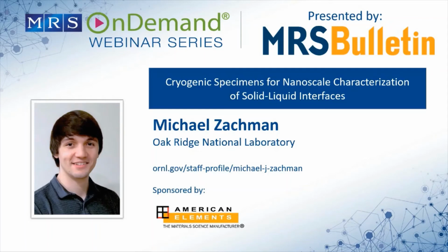There's an old theory paper that shows that that should be able to bond to lithium fluoride. And we kept finding these large fluorine-rich chunks. And so that kind of supports also that they're forming this kind of composite material with the ethylene and the fluorine chunks. But yes, we think they're bubbles basically from the decomposition, not from the beam.